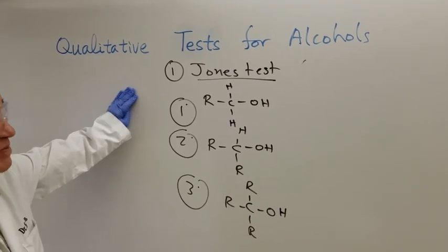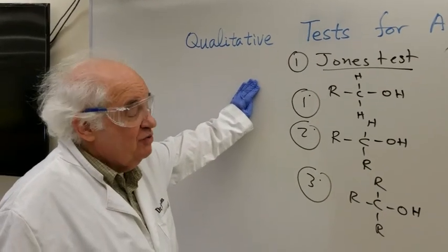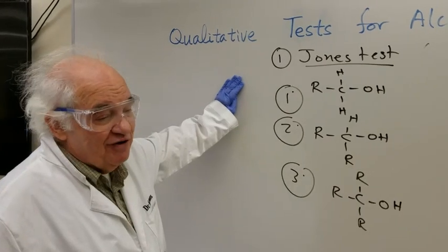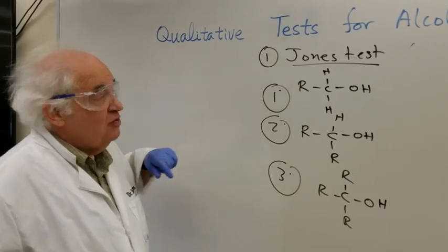Hello, ladies and gentlemen. I'm Dr. Sferanos, and I am privileged to work with Dr. Shin, who is our official photographer. Basically, today we're going to do qualitative tests for alcohols.